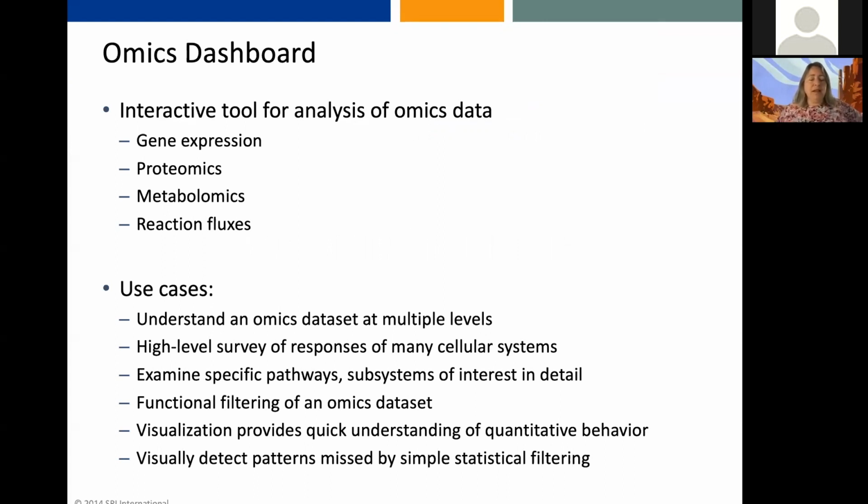The idea here is you come in at a high level, you want to understand your omics data set with an overview of many different cellular systems, and then you can drill down on particular things that are of interest in an interactive way, and hopefully visually detect patterns that might not jump out at you when you do a simple statistical filtering.